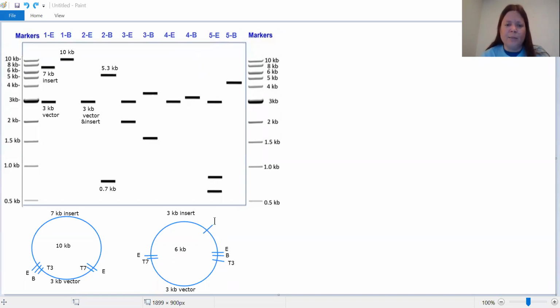We'll label it as BamH1, and then we'll just put sort of a little note here indicating that that piece is 0.7 kb. You don't need to label it separately as insert or a BamH1 fragment or whatever. It's pretty clear if this is a 3 kb insert that that's what you mean. So that's our map of plasmid 2. Now we go to plasmid 3.